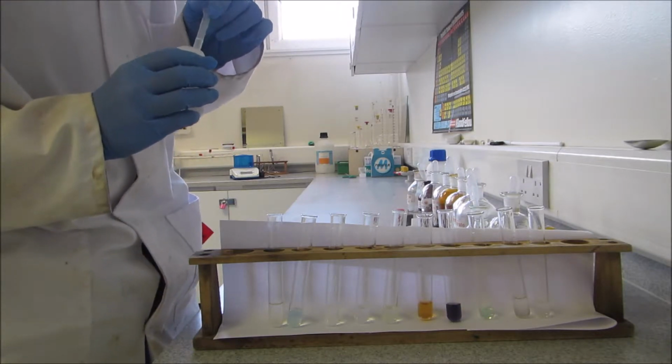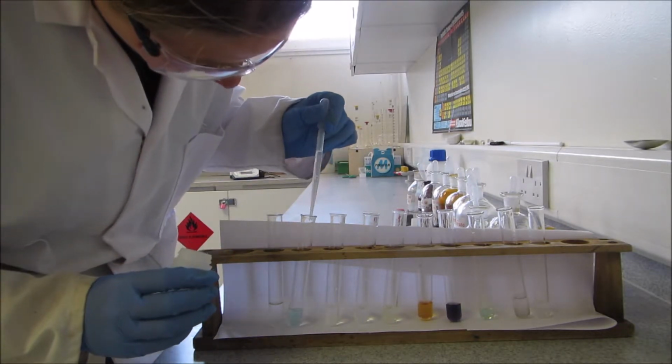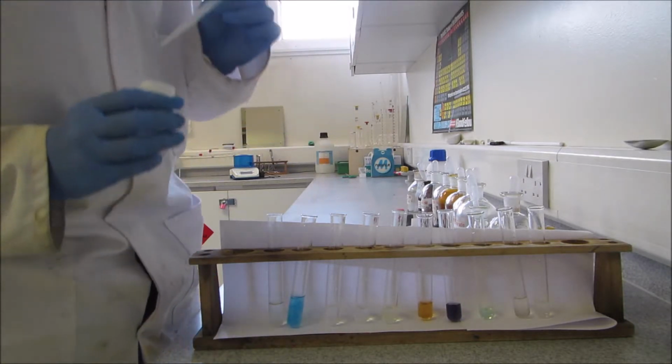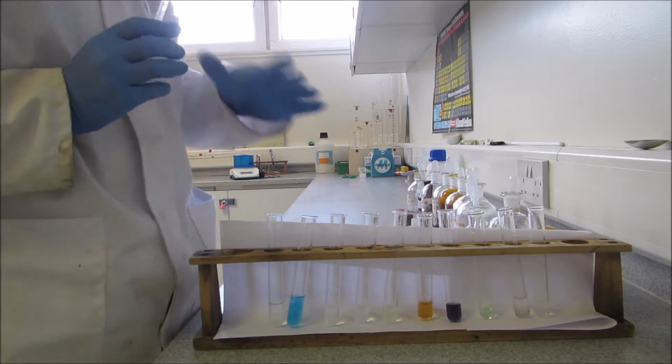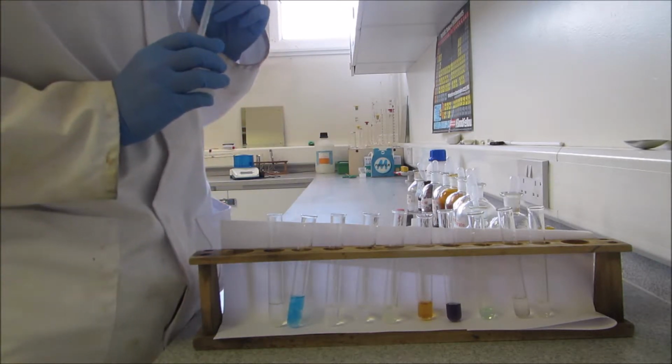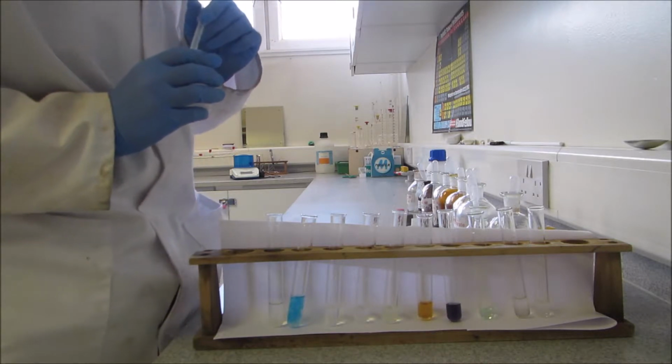So the next one is copper, and when I add the sodium hydroxide, a blue precipitate is formed, and that positively identifies it as copper, so I don't need to do anything further.